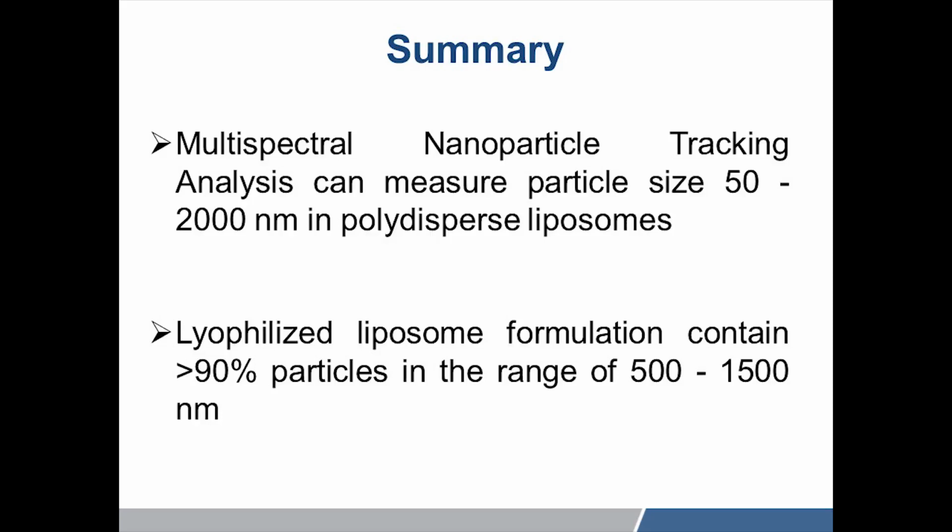of multispectral nanoparticle tracking analysis, but it has a separate application which is sinking mode. And sinking mode is based on the Stokes law principle. So there you can use this application for formulations which contain really heavy particles which are actually settling down in the time of the experiment, like gold particles which are quite heavy. And there the range can be further enhanced, and it is promised to actually work up to 15 micron size range, which is quite huge, if the particle shows sinking in the time of the experiment.